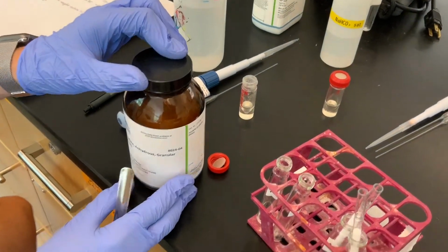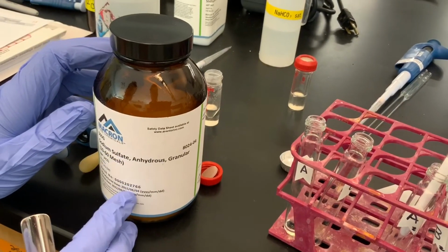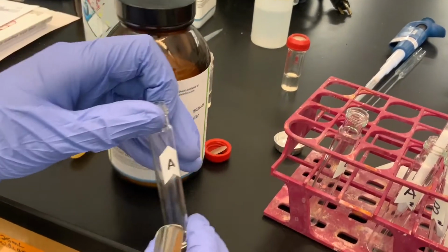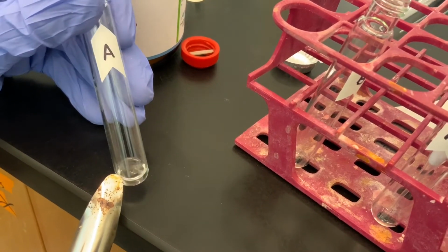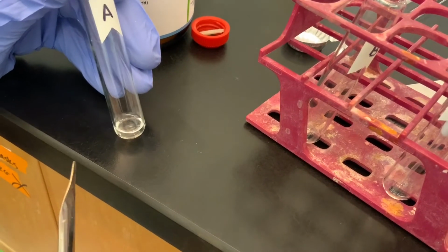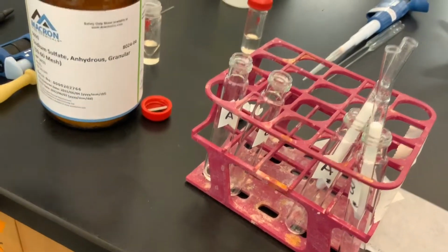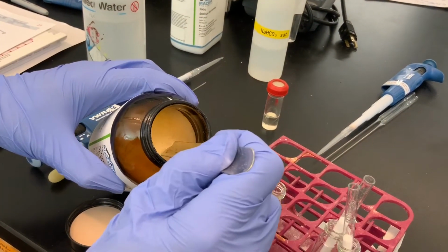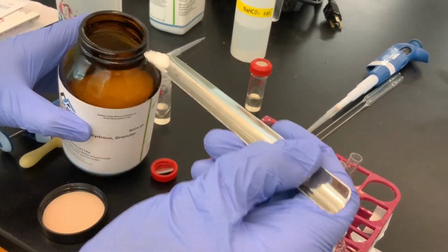Okay, so I'm going to now add anhydrous sodium sulfate to culture tube A. We did a pretty decent job transferring the methylene chloride over. If you look closely here, we do not see any real droplets of water stuck to the sides of the glass. So the sodium sulfate that we're going to add is just going to dry the organic layer. It's going to remove the water that we cannot see with our naked eye. And so I'm not going to use too much. I'm going to use this spatula here and just use a little tip full.